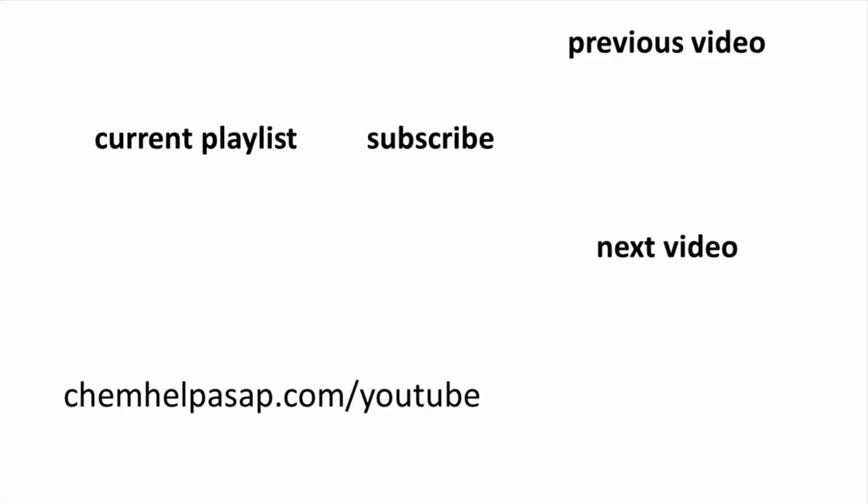I hope you enjoyed seeing this example of an aldol condensation and preparation of dibenzylideneacetone.